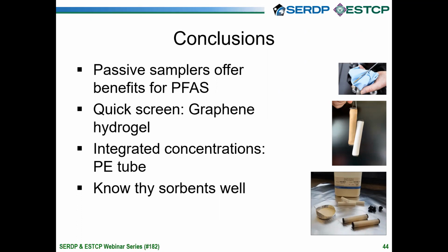The polyethylene tube, on the other hand, is a tool for integrative concentration. So it's something that's best deployed over several weeks, and then you just get one number that reflects the entire deployment span. And the last part, of course, is make sure you know what you're working with by getting the right numbers.